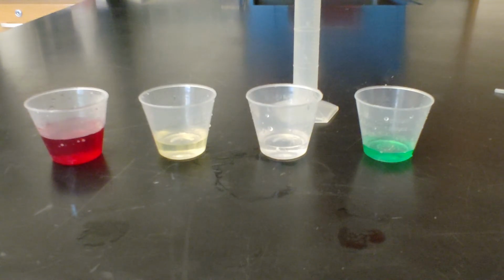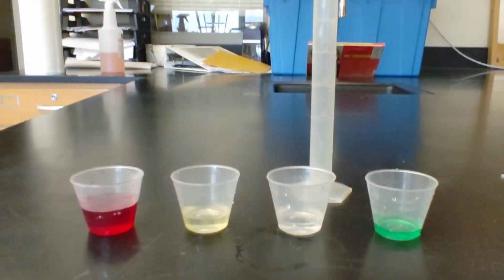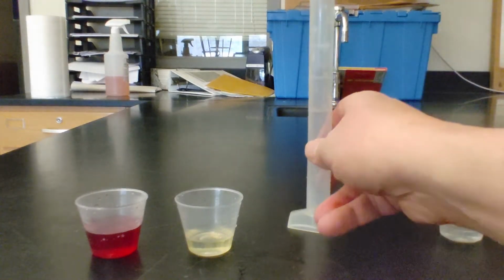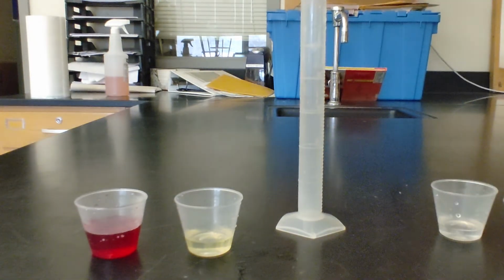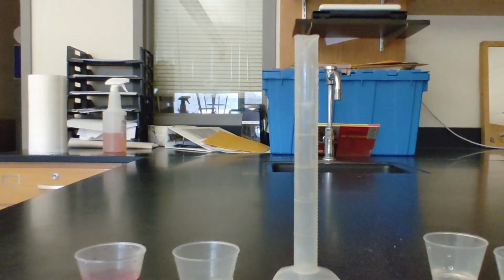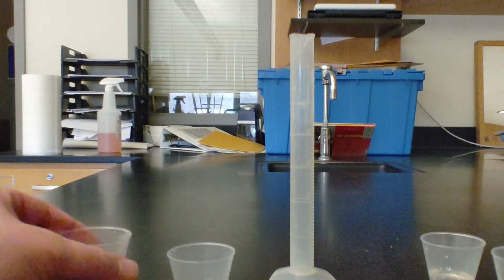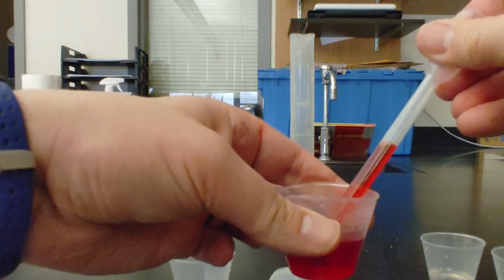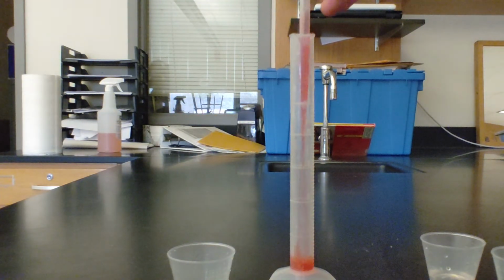Okay, now that you have paused the video and taken a second to look at it, I am going to take all of these and put them one at a time in this graduated cylinder. It's a 25 milliliter graduated cylinder. And I'm going to start with the water. And put that in.